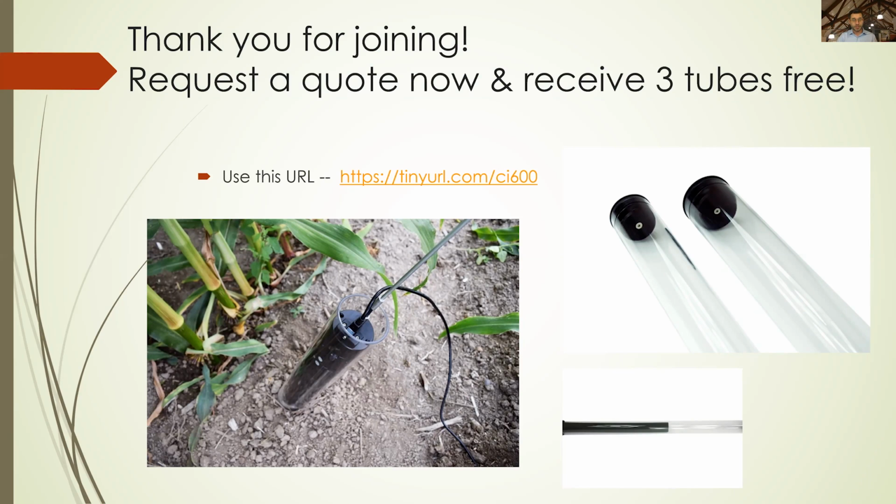The next question, is there a special application to suggest the CI-602 to a customer? We do have a couple different reasons I would suggest the 602. One is that the 602 does go up to 1200 DPI and is a little bit faster scan, so you can do more rapid scanning with that and at higher resolution. So if you really need to do parasite studies, mycorrhizal studies, a lot of fine root hairs, you can get it with the 600 at the very edge, but with the 602 you definitely have multiple choices of resolution level.